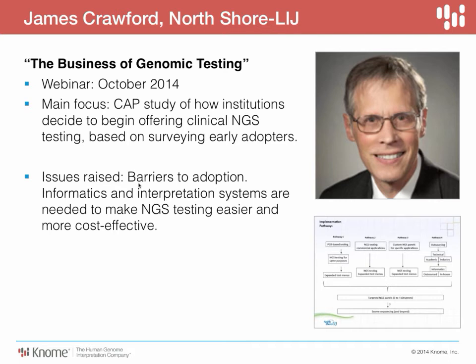From Dr. Crawford's seminar, he identified 10 common barriers to adoption. Those are also highlighted on Knome's website in our blog. So feel free to read about them over there. But what struck our attention was that among these 10 barriers to adoption, a lot of them revolved around the challenges of informatics and interpretation, so that your existing staff can handle the work without having to do a whole lot of software development or hiring people that might be hard to find.